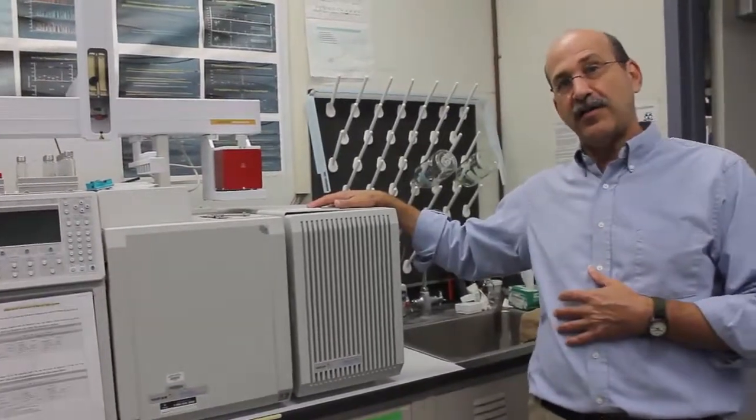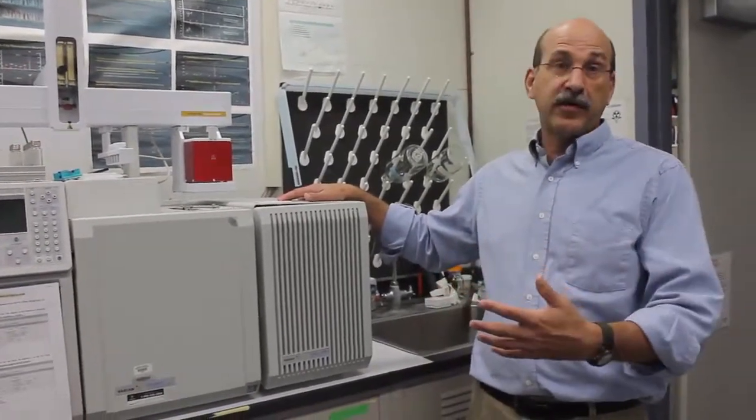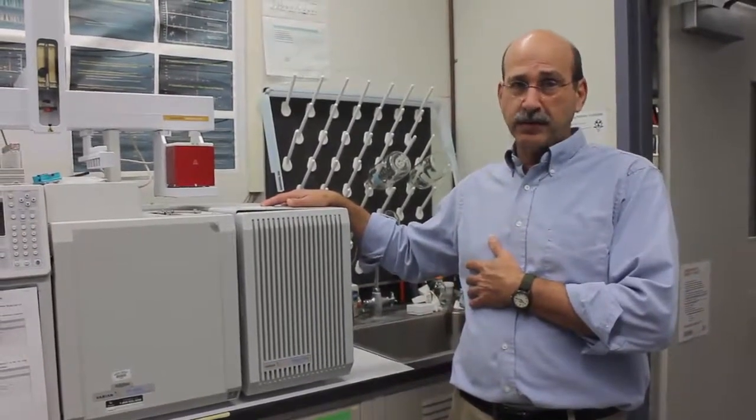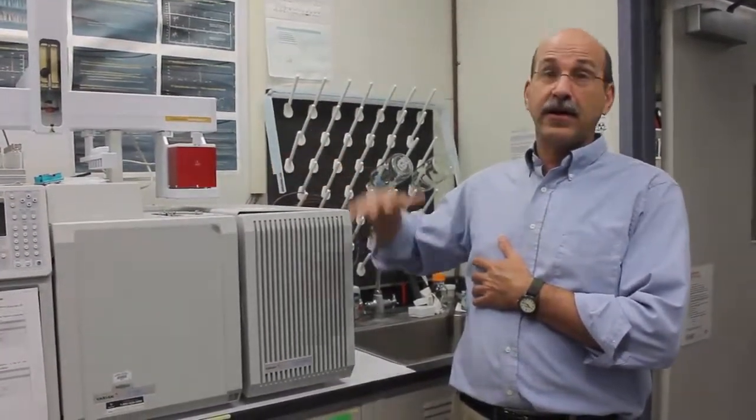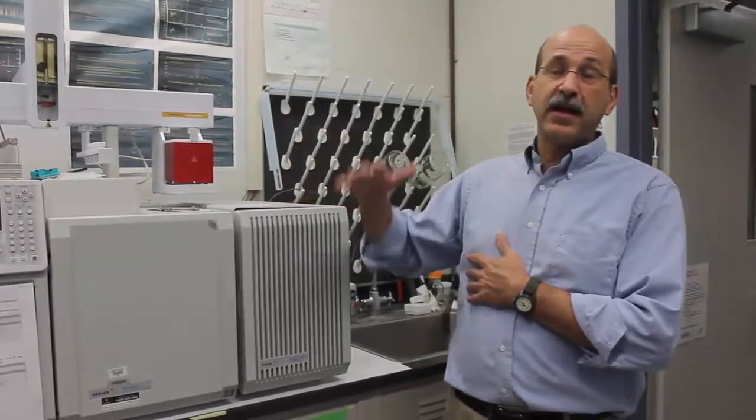Over the course of about 10 to 15 years, we discovered more than 1,000 compounds that are unregulated that are in our drinking water. The good news is the concentrations of all these compounds are very low. But it allows us to look for things that previously haven't been discovered in our drinking water. And we've also scanned for other things. We've used this instrumentation to measure concentrations of pesticides, biological samples, such as serum and even brain tissue of people who have Alzheimer's. One of the things that we recently found was that the concentration of a pesticide metabolite, DDE, was higher in Alzheimer's patients than control patients.